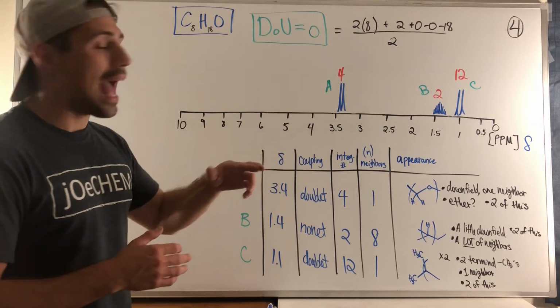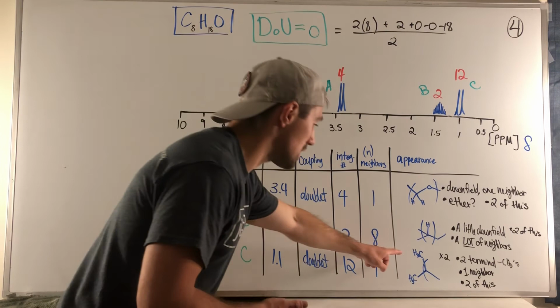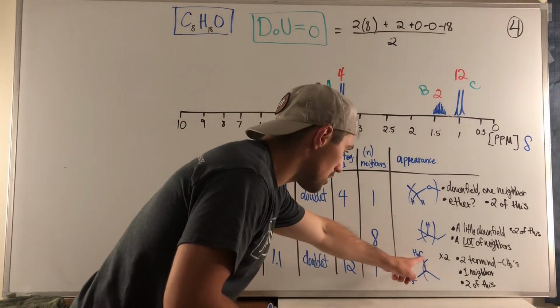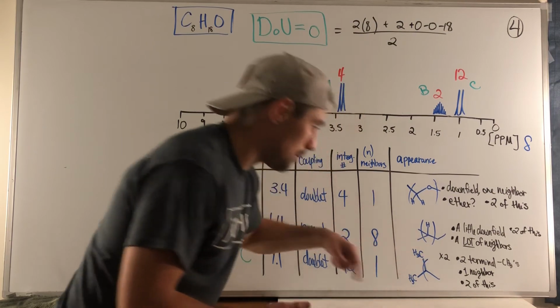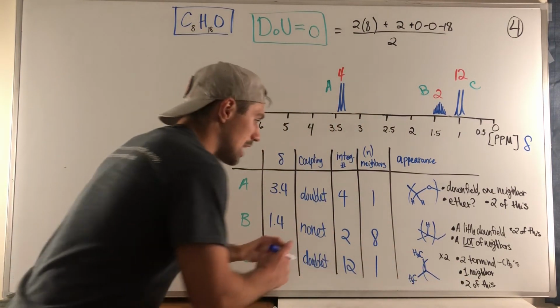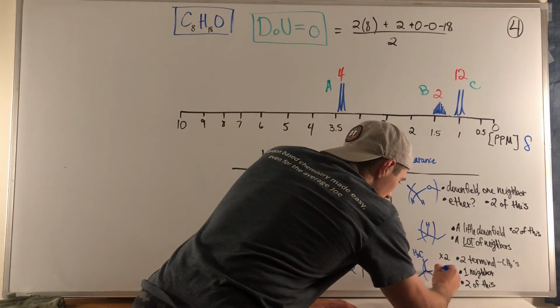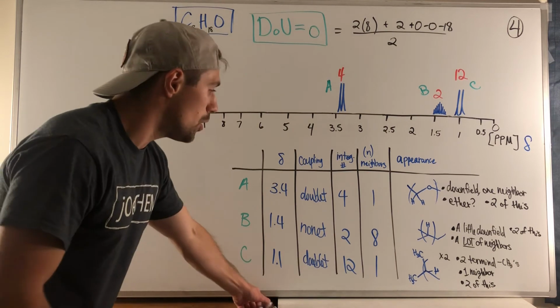What if we had 2 of them and, more specifically, what I would maybe call an isopropyl group, where you have 2 CH3s with just 1 neighbor right there. Then you have the rest of your chain, right, from the carbon that would only have 1 hydrogen right here. So this would be 6, and then the other side of your chain would be just like that.